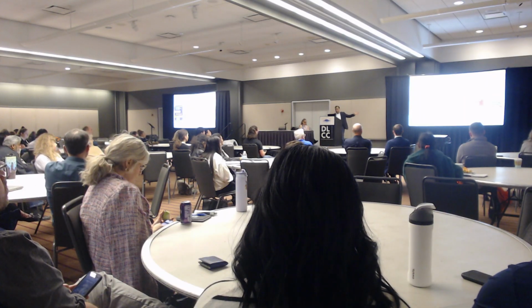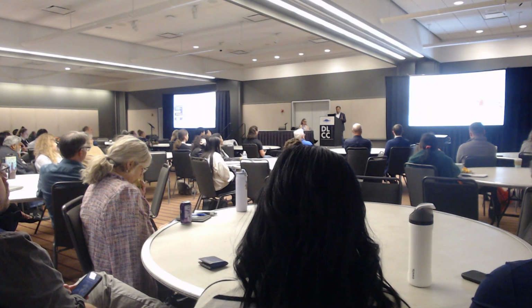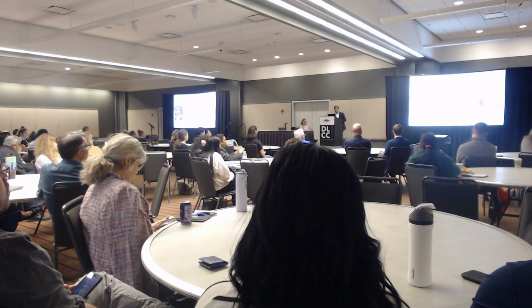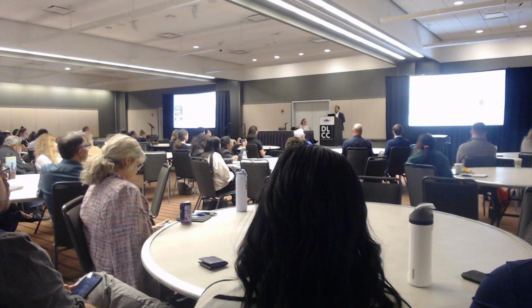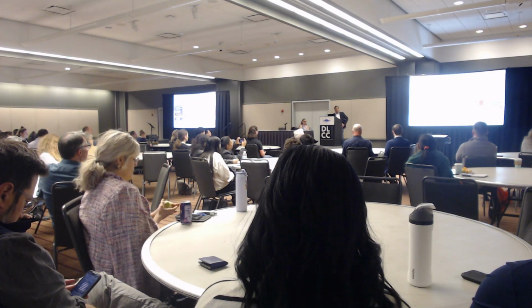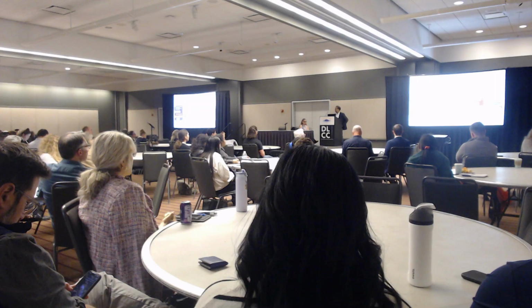This is our portfolio for the chromatin analysis. We started a few years ago just doing ChIP. We now have a high-throughput version of ChIP and a high-throughput version of CUT&RUN. We started doing a lot of ATAC long ago, but considering we are in a clinical setting, there is now a lot of interest in cell-free DNA, so fragmentomics, as we heard earlier. So we have established protocols now to do cfChIP-seq, and this is from plasma.